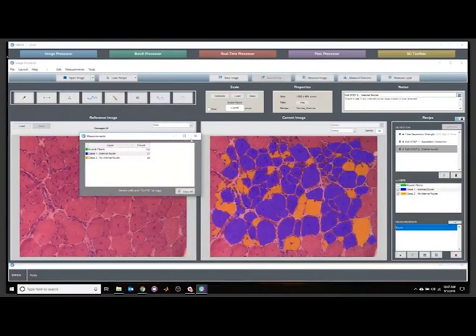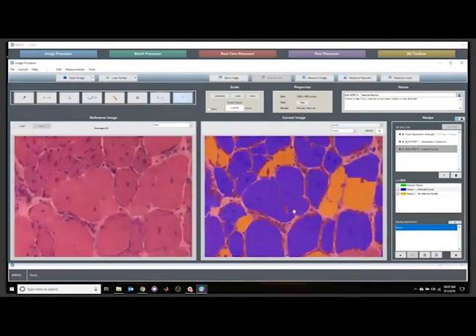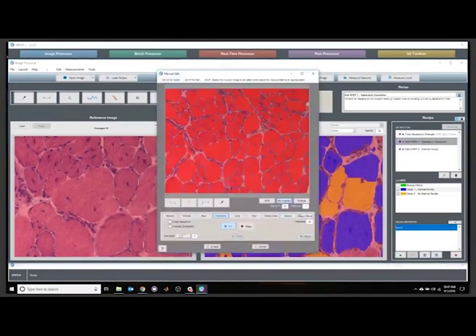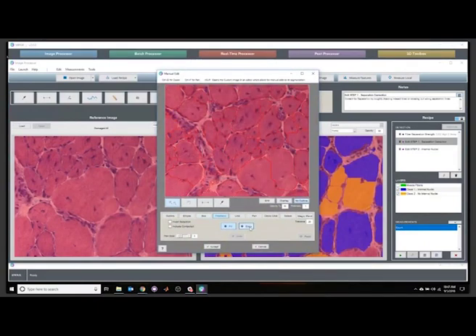again, this does a very good job. It gets you most of the way there. You can look for spot checks where there's bad sectors, where stuff is not perfectly separated. And we can go ahead and do that fairly quickly. Things like this, I can go ahead and just hit fill freehand and just circle stuff like that.